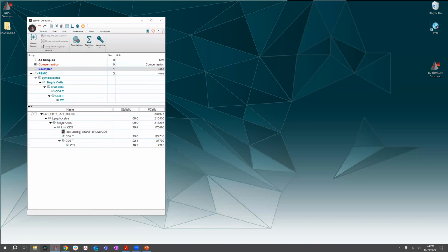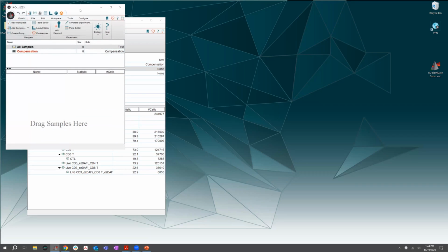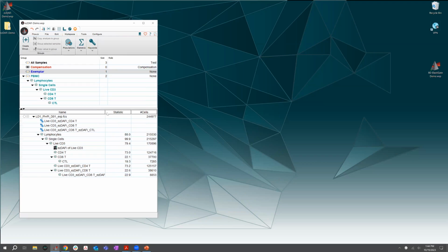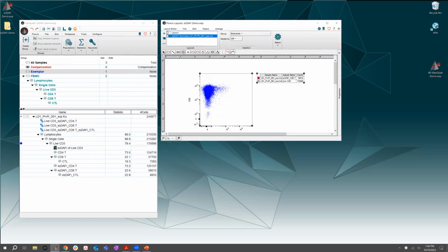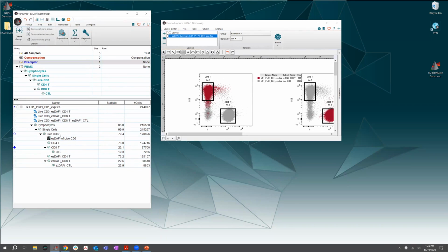Okay, this one is taking some time to run. So what I'm going to do is open a workspace where I had this. Well, of course, as soon as I did that, then it finished. But I do still have a workspace where it finished already. But in any case, right, of course, now it's completing everything as I threatened to open a completed counterpart. But we can see the tool's finished running, right? And I promise it doesn't normally take that long.